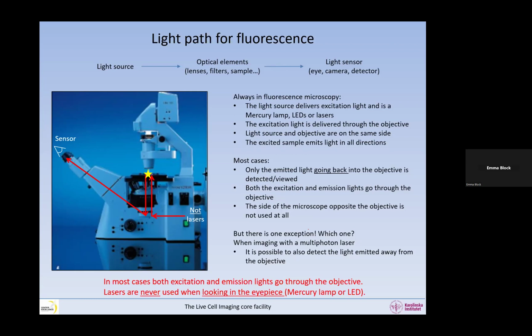Maybe, but the lamp we use for the bright field is inside the microscope itself, while the halogen lamp is a box next to it. I think the halogen lamp is always for transmitted light. If it starts with H, it could also be a mercury lamp, because Hg is mercury for some reason. But I think it's likely a halogen lamp, and that you use for transmitted light.